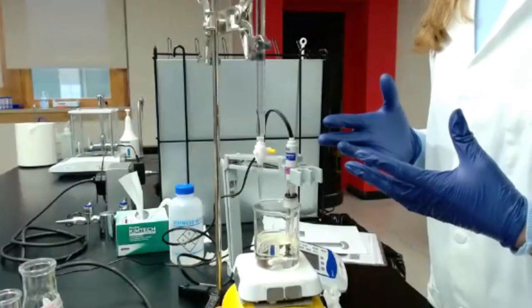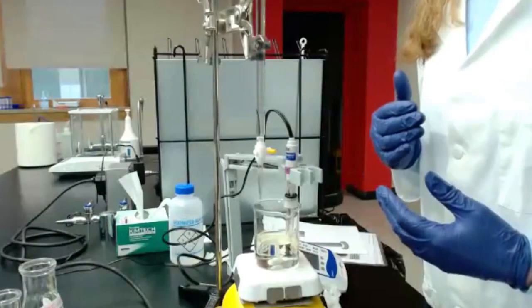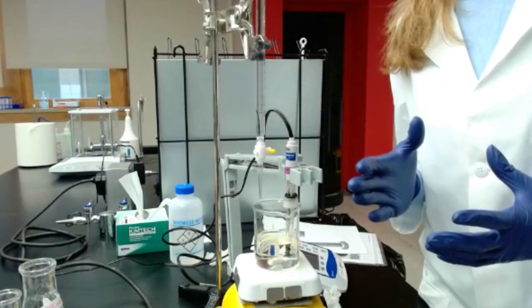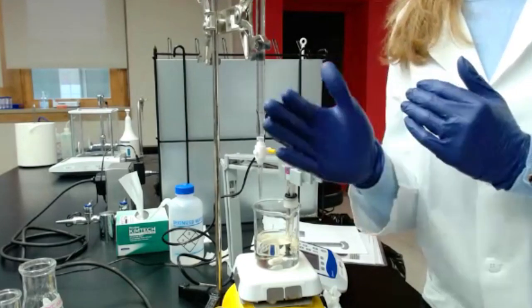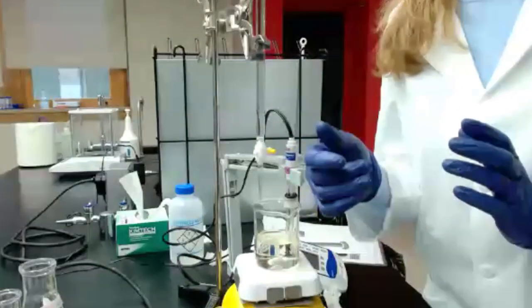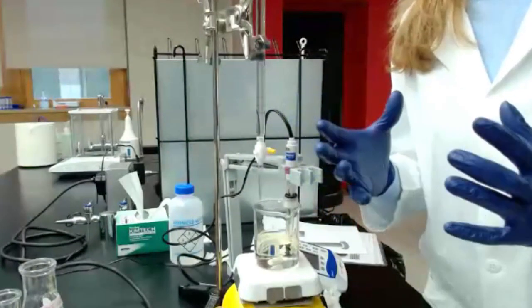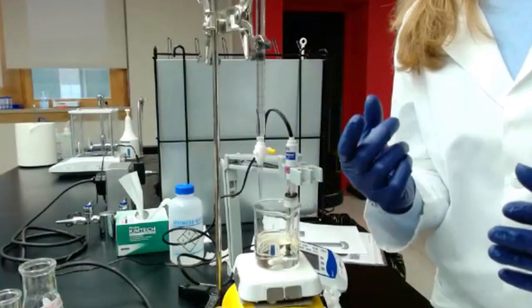Also, when you do titratable acidity analysis in grape juice to evaluate when it's time to harvest, it's much better to have a large representative grape sample. You should go into your vineyard and gather grapes from different locations within the same row, from different vines, and from different rows. Make sure you get a pool, a real representation of your samples. Then you make juice from that pool of different clusters, rather than getting juice from just one cluster.